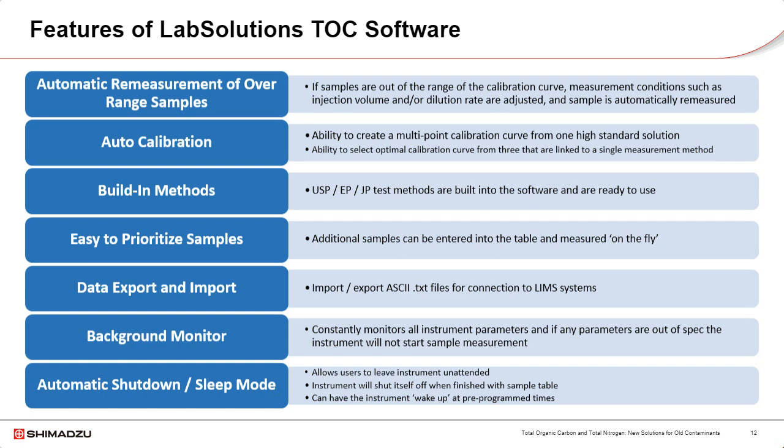The instrument also has the ability to add samples and edit the sample sequence on the fly. So this is really cool. If people come into your lab and have priority samples that need to be run on a moment's notice, the sequence does not need to be stopped in order to do this. You can simply pause the instrument, add those samples, and continue right on with your analysis.